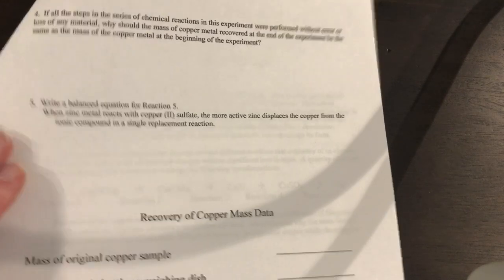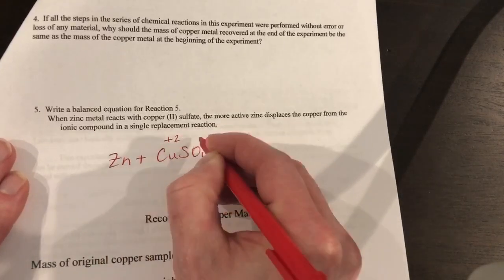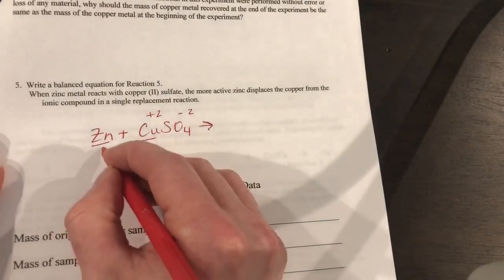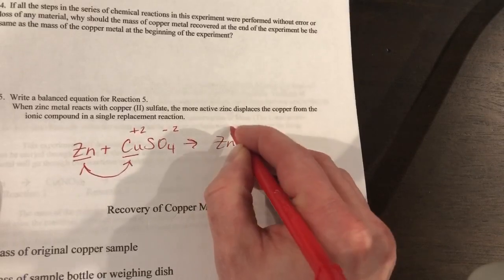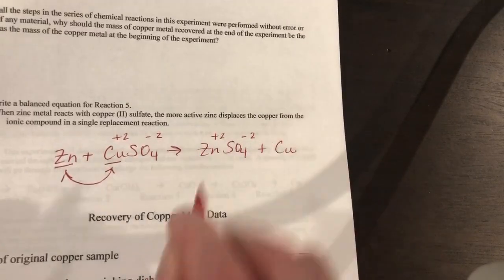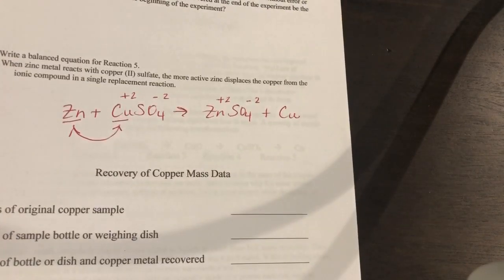Okay, our last reaction. It says zinc metal reacts with copper 2 sulfate. If we use our activity series, zinc is more active than copper, so they're going to kick each other out. Zinc always has a +2 charge. Sulfate always has a -2 charge, plus copper metal. So that's how we get our final product, by this reaction right here. And it should be balanced.